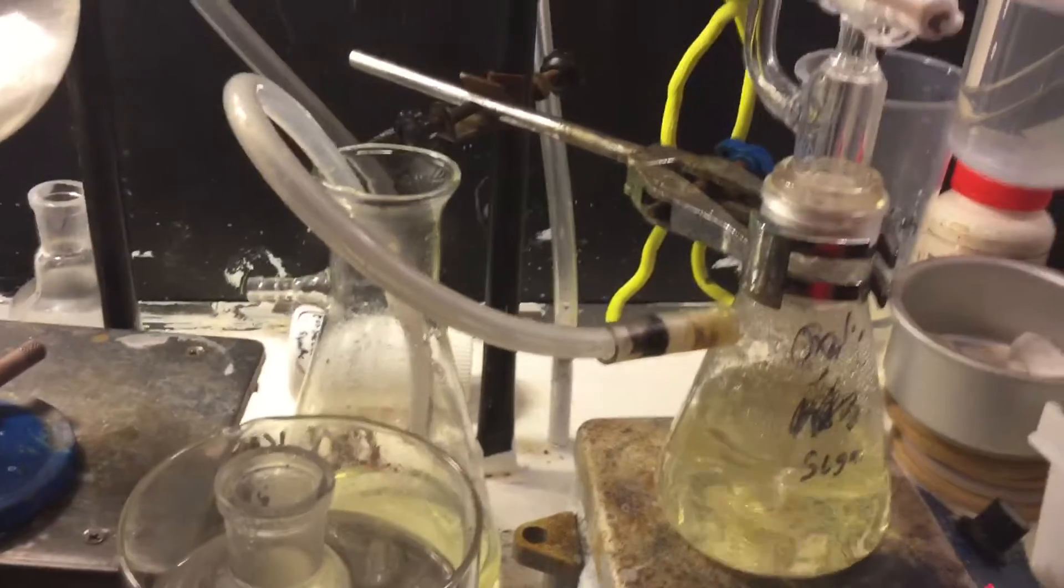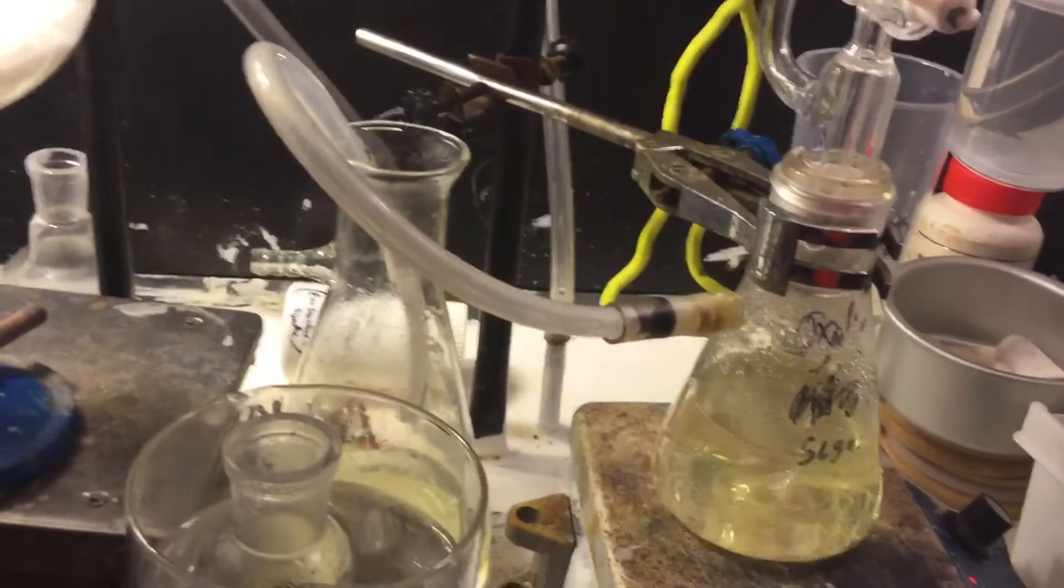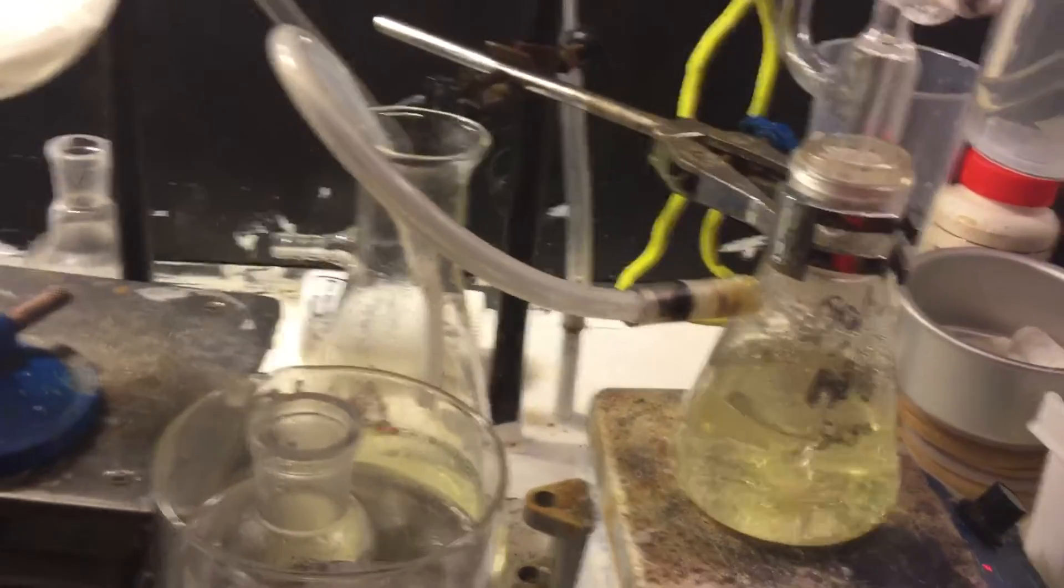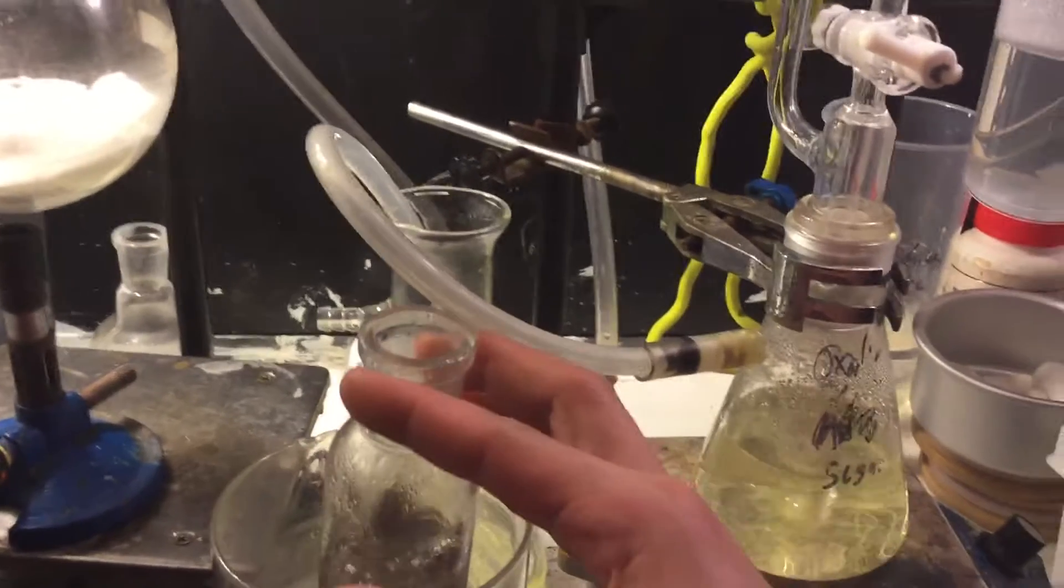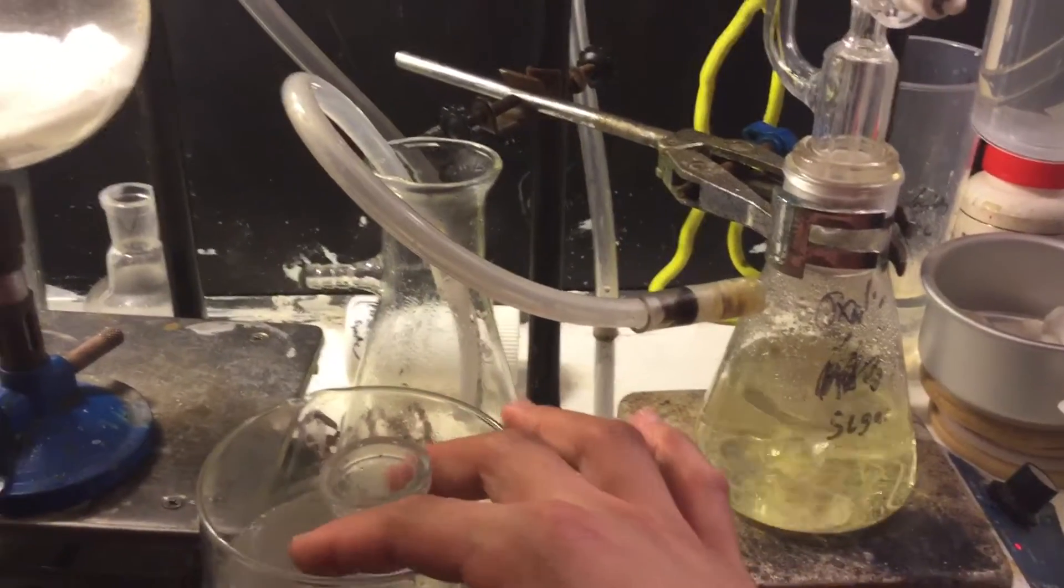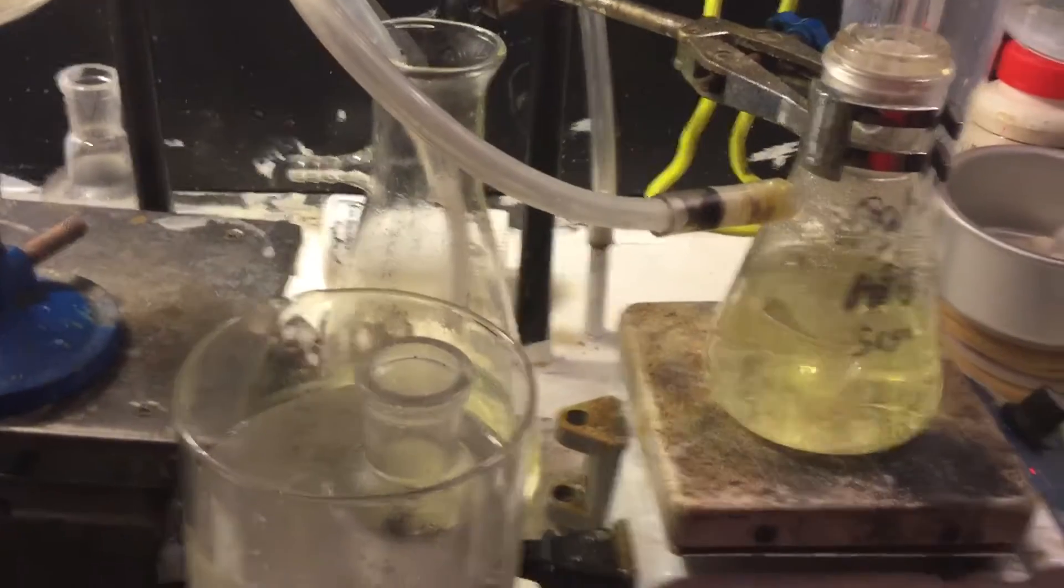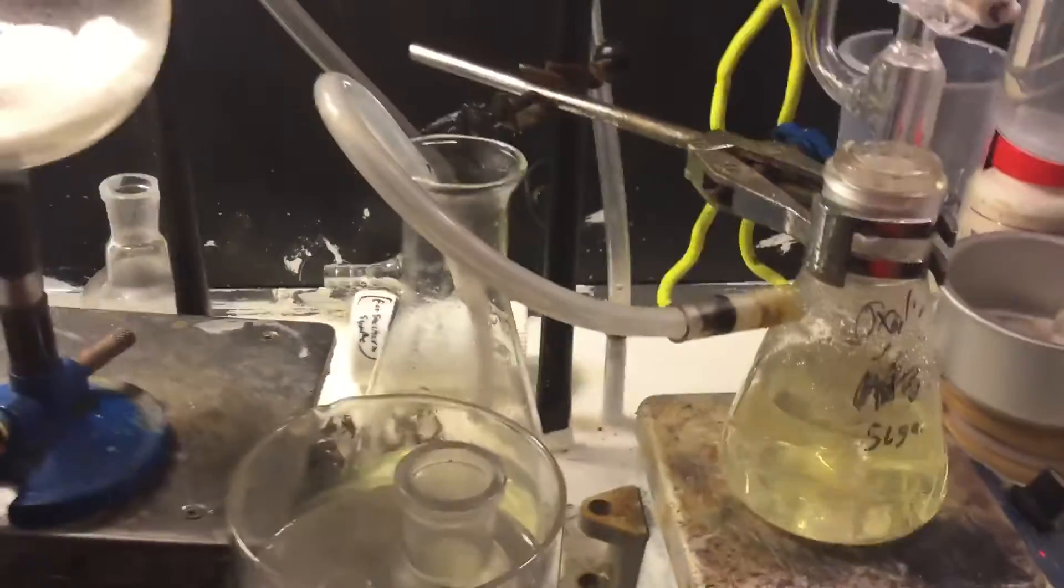To get even just a few grams, you need over 20 liters of chlorine gas, which is just, you know. So I was trying to see if I could dissolve aluminum in methanol with HCl, but probably got some water in that.